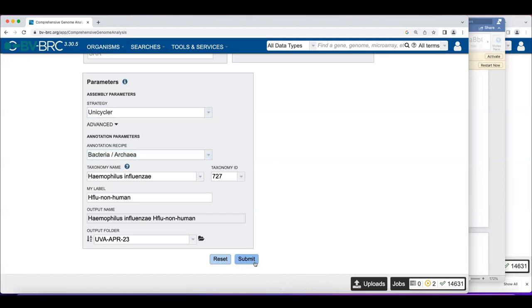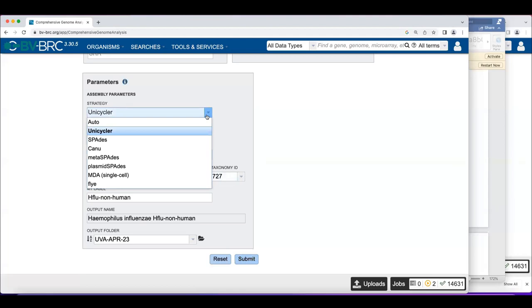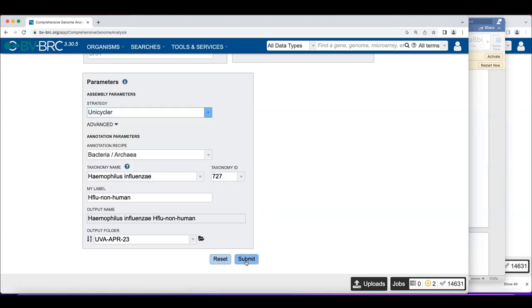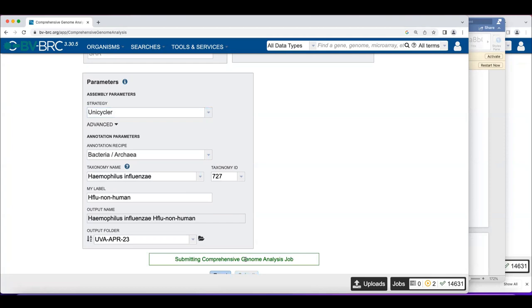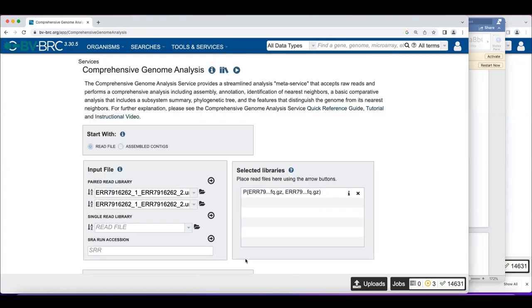If you have long reads, you can do a hybrid assembly. Unicycler is smart enough to recognize when you have a mixture of short and long reads and can use the long reads for polishing. The auto recipe is also smart enough to handle a co-assembly. You would not mix long and short reads as pairs — you'd have a paired-end set and then a single read library for the long reads, pushing each separately into the job interface.